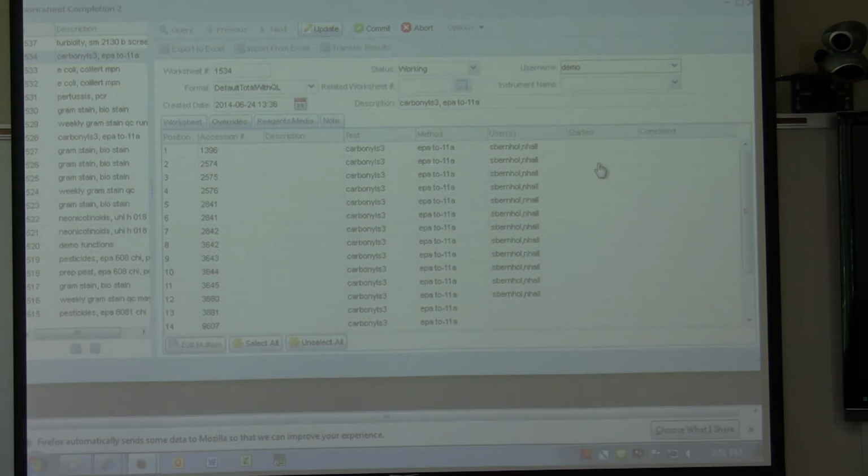You're going to get all this from the instrument interfacing though. Not for QCs. Yeah. The started date of your QC, that's going to come, they'll get the injection time for the QC. But then it won't work though. See, if I understood what they were doing, they are pulling their QCs from their prep worksheet from 2 days ago, and that's the QC they are putting over here. If that's the case, then the started date for that QC is 2 days ago, not when they're running it today. Did I understand that?